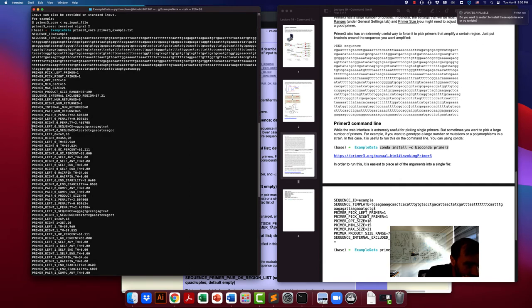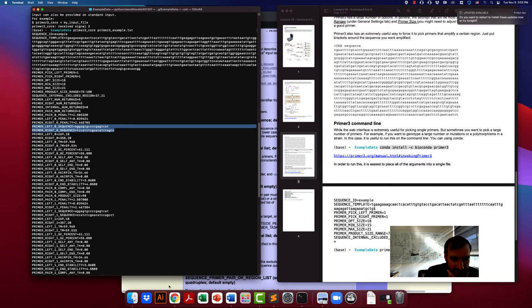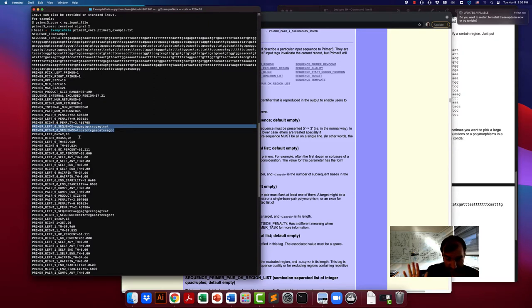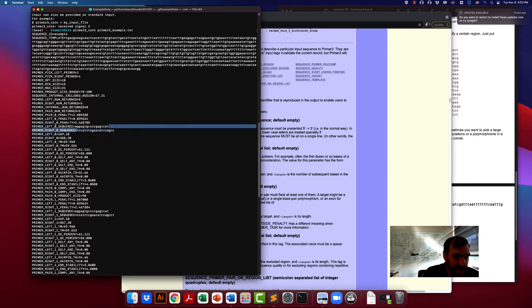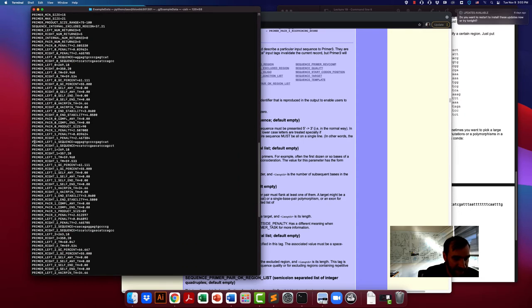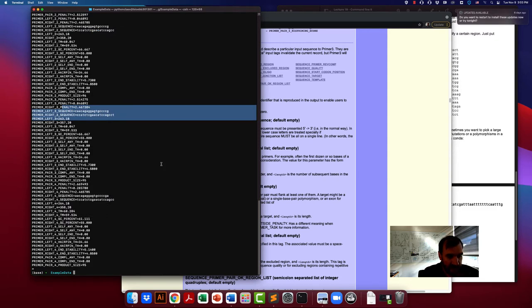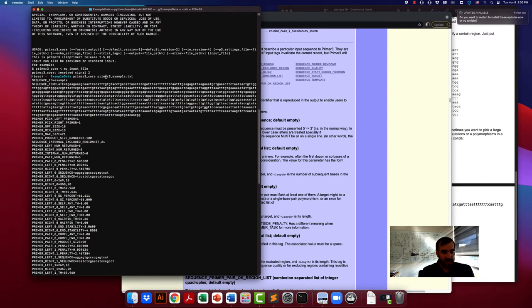Here I have successfully run the program and it has returned a bunch of different primers. The zero primer is the best primer, so this should be pretty similar to what you find in the web browser, although versions are not always exactly the same. If the web browser isn't running the exact same version of Primer3 as your command line, there'll be subtle tweaks that might change what the best primer is. This returns the left sequence, the right sequence, and other information like melting temperature and GC percentage, and it does this for multiple primer pairs.